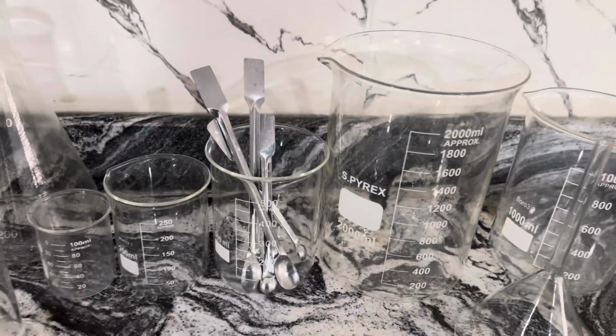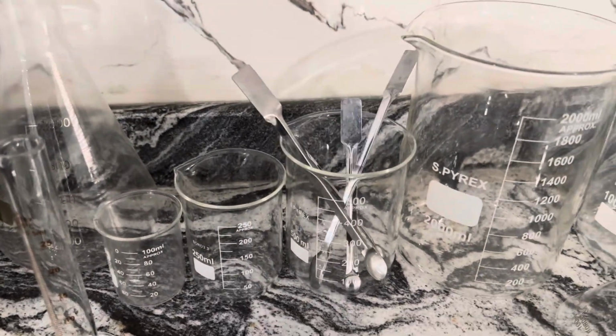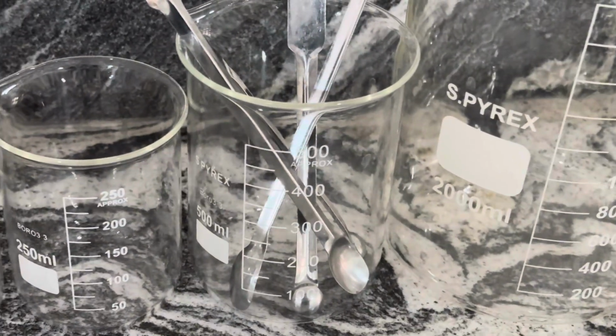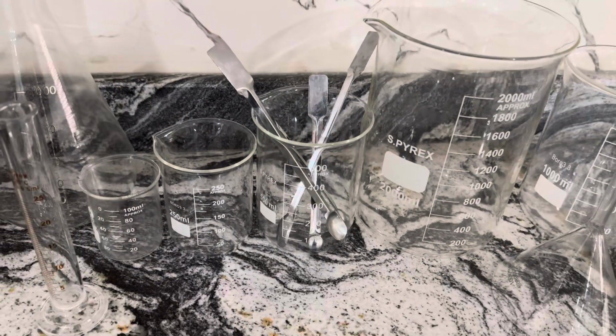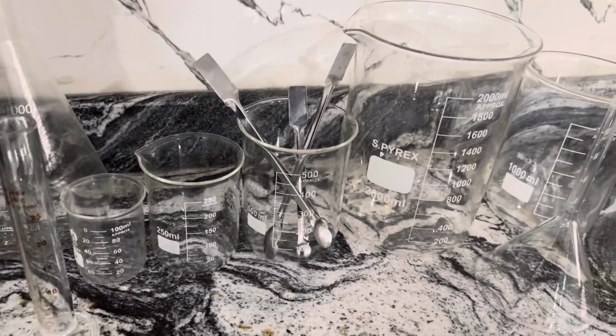Then you can see the spatulas. These are the spatulas. Spatulas are used to take the raw materials, solid or liquid chemicals.